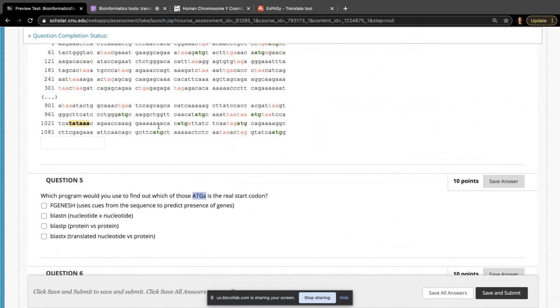And I did this in class, so I wanted to tell you that there are programs that will look for, okay, if this is an ATG and it is a start codon, then if you look at each tree and you go down the line, I don't think that this TAG is in frame, meaning if I go each three here, and then this, oh, okay, these three. So when I say that the TAG, which is marked in red, is a stop codon, the TAG is not in frame, because if I read these three here, then TAG doesn't get read together. The ATA is what gets read together. So there are programs that will look: if this is read as these three, would this TAG be read in frame? And if so, is the distance between the start codon and the stop codon something that is reasonable for the length of a protein?